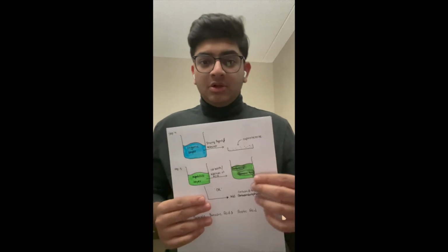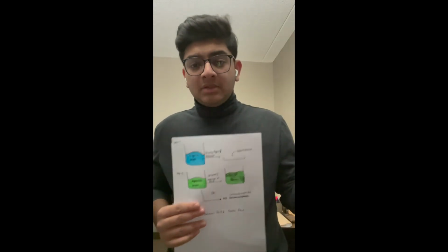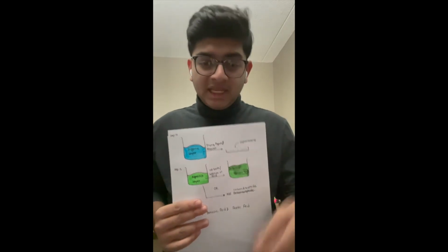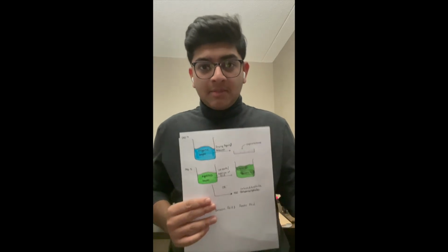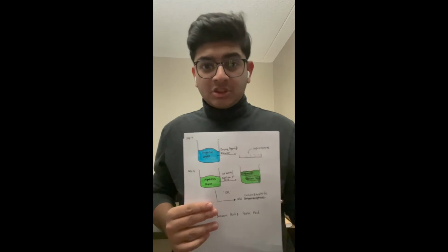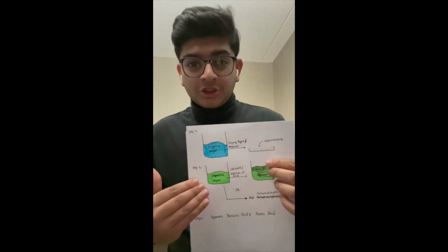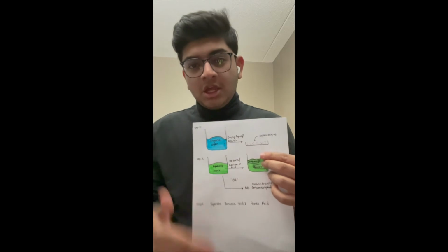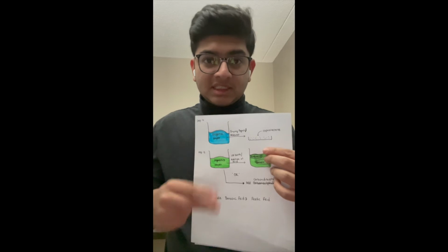The other way that we can follow to remove the acetic acid and benzoic acid would be by adding the base and with that carbon disulfide. Now, as I said, benzoic acid would not be soluble in water at room temperature, but it is very much soluble in carbon disulfide at room temperature. So this is just like performing our liquid-liquid separation again for our acids, because we form 2 layers: an organic layer with carbon disulfide and benzoic acid, and an aqueous layer with acetic acid.